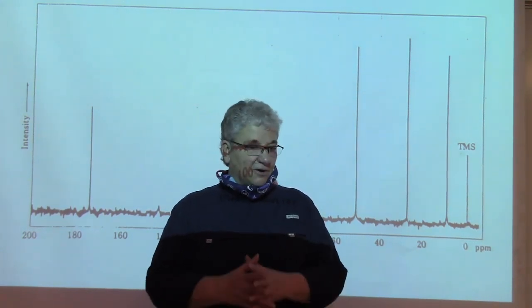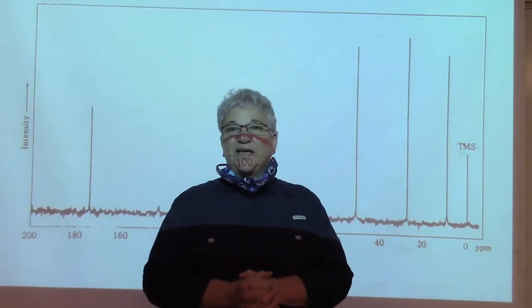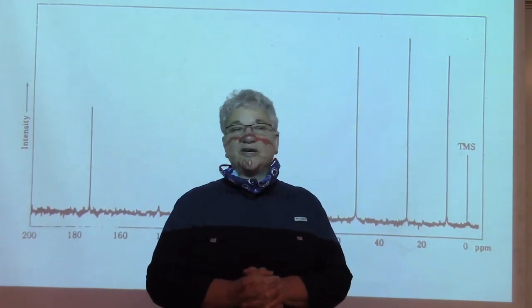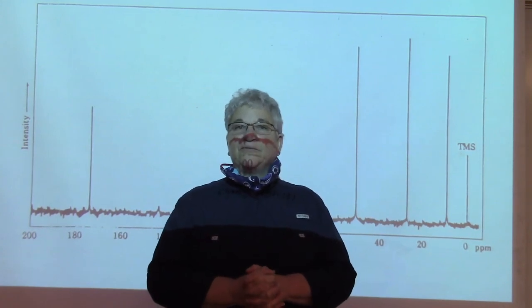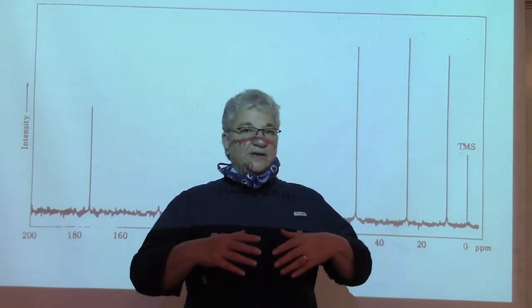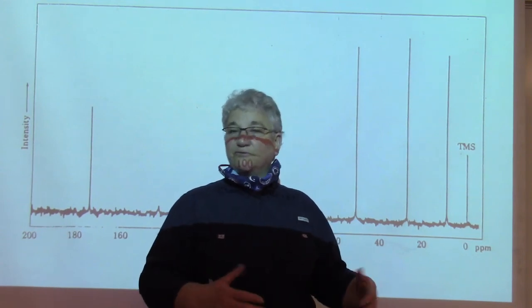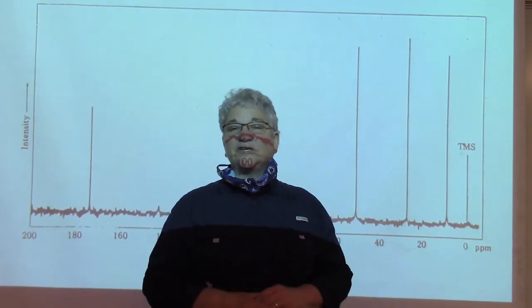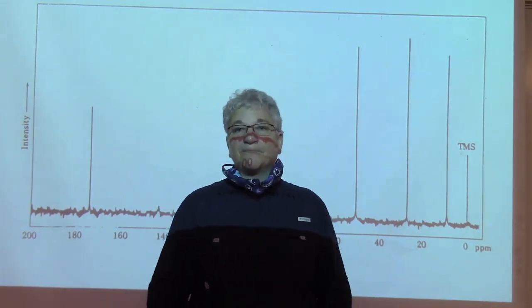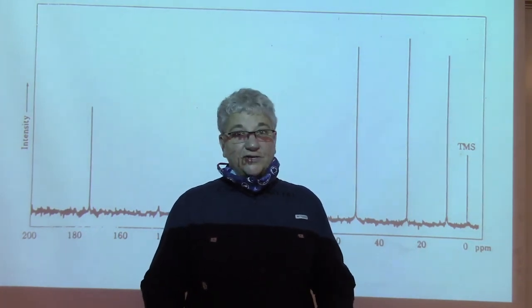So, we are going to be talking about proton/hydrogen NMR today. Remember that NMR stands for nuclear magnetic resonance. Just like C13 NMR, we're looking at the nucleus of the atom, and in order for it to spin flip, it needs to absorb certain frequencies of radiation, of energy, and that is down in the radio wave frequency end of the electromagnetic spectrum. So not very high energy.